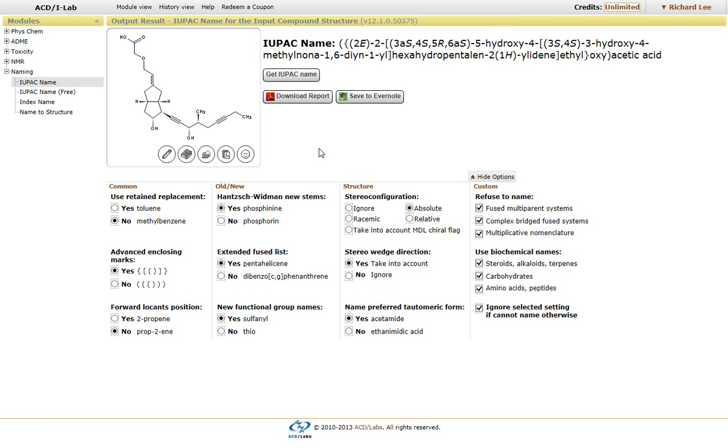There are some limitations to the number of atoms that can be observed within the structure. As long as the structure itself has no more than 255 heavy atoms (excluding hydrogens), our software will be able to generate a correct name for it.